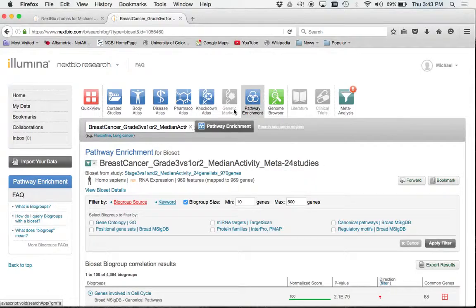Now, this allows you to generate your gene list. The Cadillac of all the bioinformatics programs out there is probably IPA. Anybody here work on IPA besides you? Oh, we got 2, yeah. We got 2 people. All right.